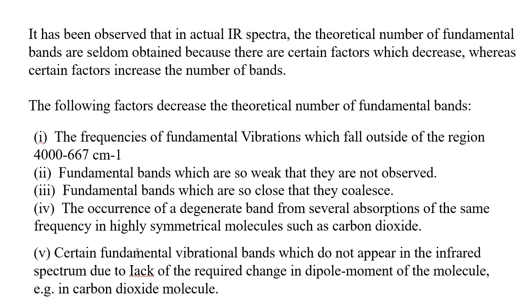Similarly, certain fundamental vibration bands do not appear in the infrared spectrum due to lack of the required change in dipole moment of the molecule, which we had already seen.